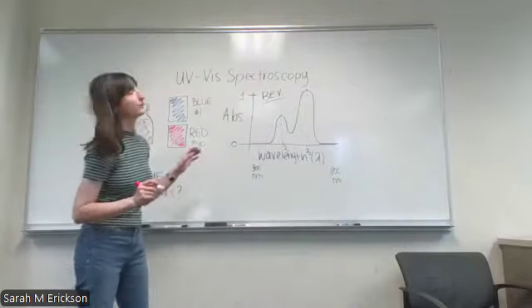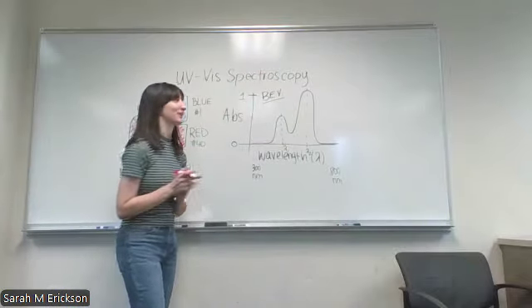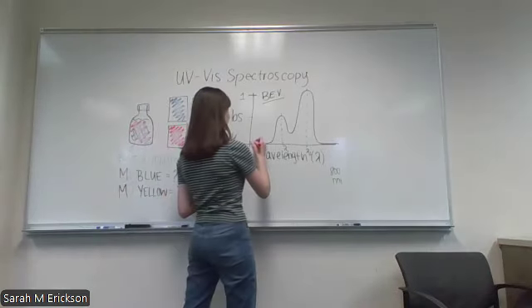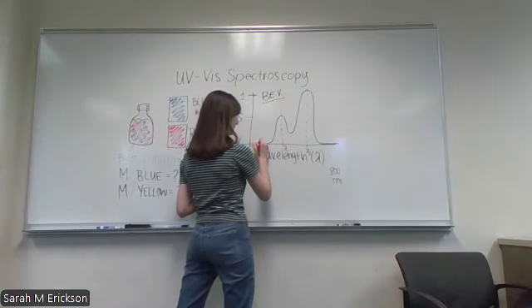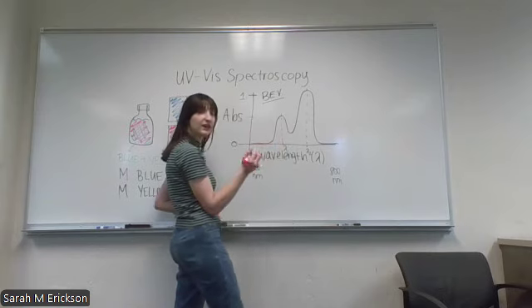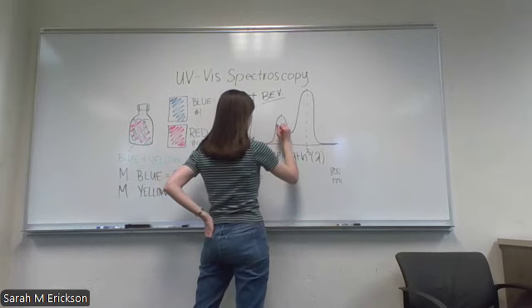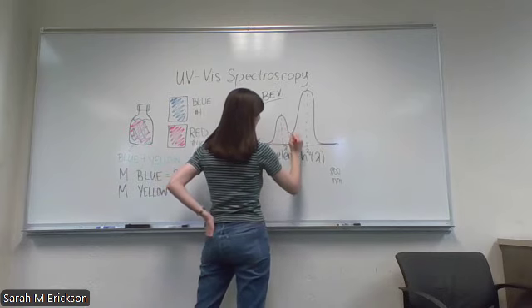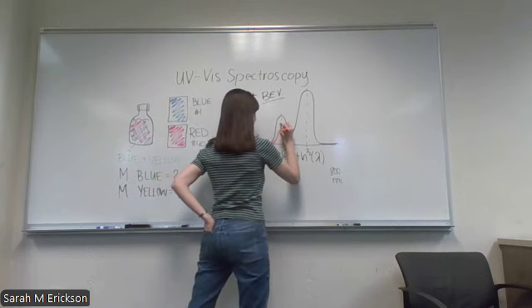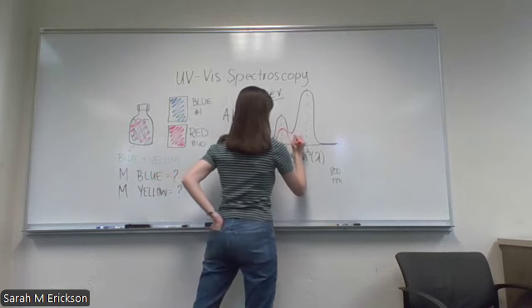Sorry, I had to check something on the screen really quickly. So let's say I cut the concentration of my dye in half. Well, I know it didn't absorb a lot of light down here, right? But maybe where it absorbed a lot of light, if I cut the concentration in half, I'm going to absorb way less light now, right? Oh, that's hard to see on the screen. So now we only absorb a little and we come back to the same place.